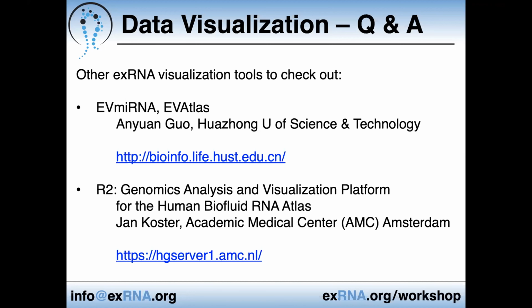Their approach was to scrape all the data sets from GEO and SRA, do their own RNA-seq processing, and create their data exploration tool, which fits with the ERCC's mandate of making all this data publicly available so the whole community can do whatever they want with it. So take a look at that.